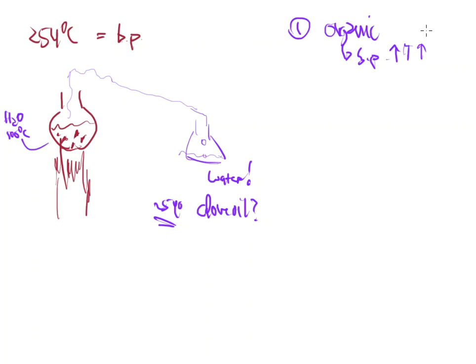You could choose a different solvent, and make sure that solvent has a higher boiling point, closer to the eugenol boiling point, and maybe you can really crank the heat into this stuff and really get it to go over. The problem, though, is that there's actually an easier way to do it. And number two is to use water, but this time use steam, because steam is actually hotter than boiling water, or the soup of boiling water that you've got.